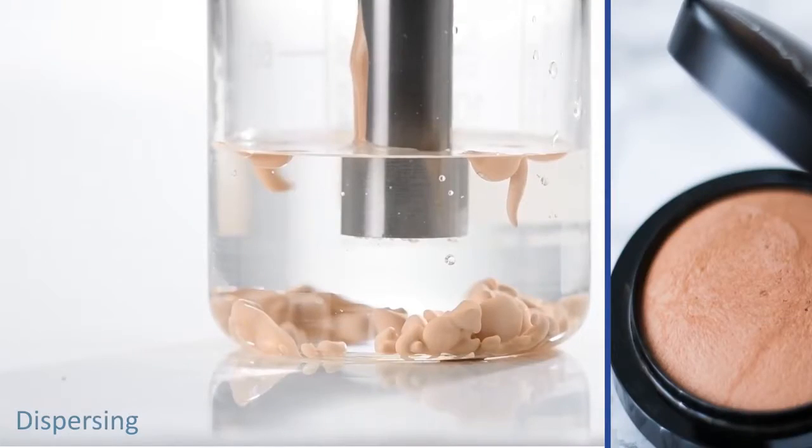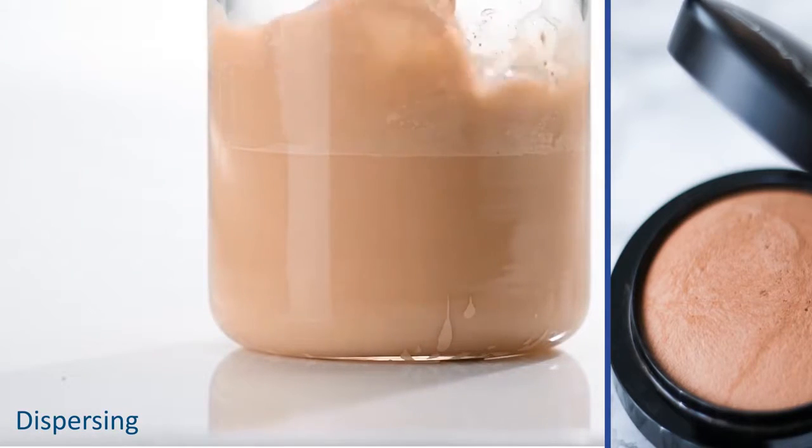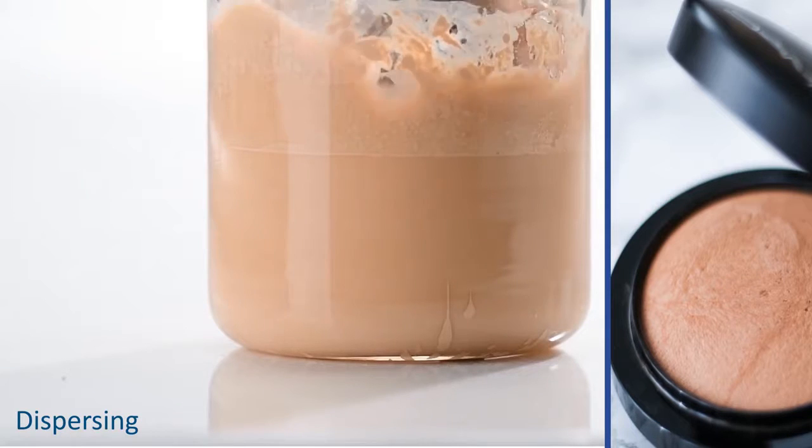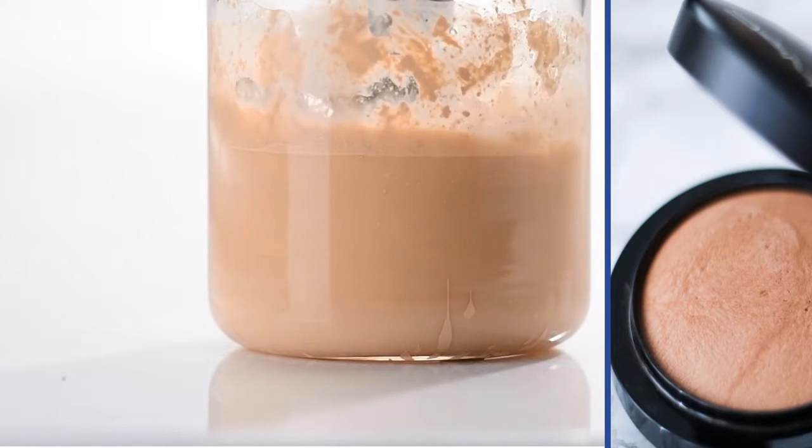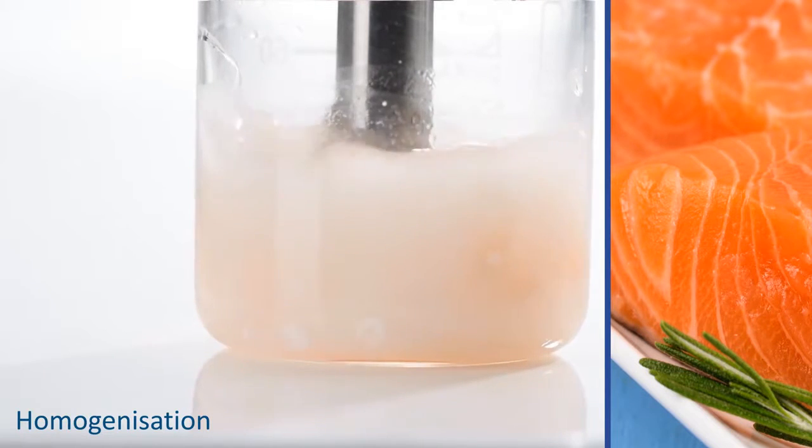After only a few seconds, many samples, such as ones of makeup, are perfectly homogenized. These extremely finely dispersed samples generate reproducible analysis values.